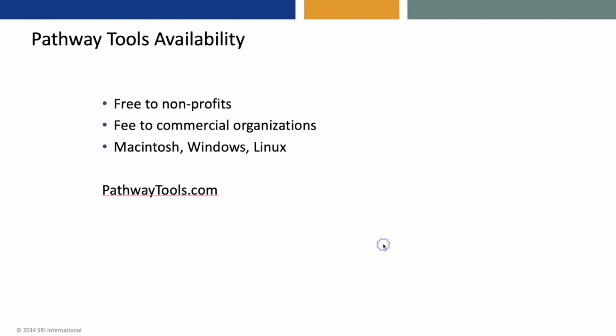And I'll note that Pathway Tools is freely available to nonprofits. We charge a fee to commercial institutions. It runs on the 3 major platforms, and you can find out more at our website.